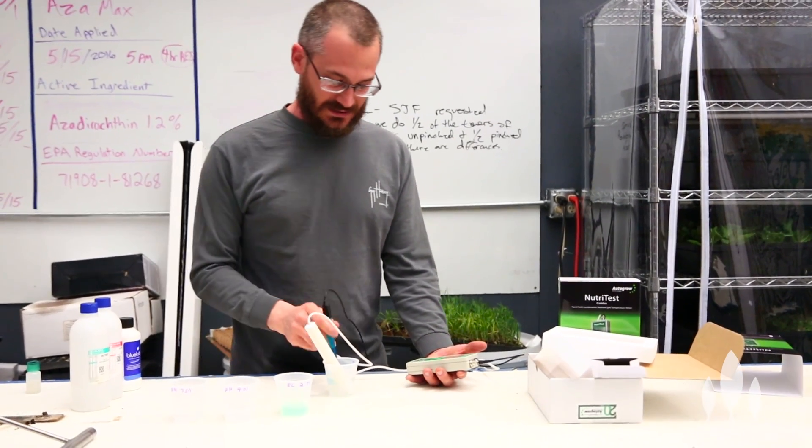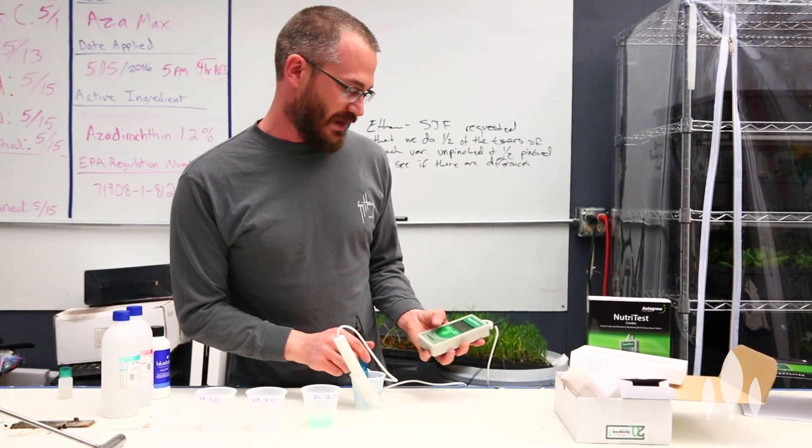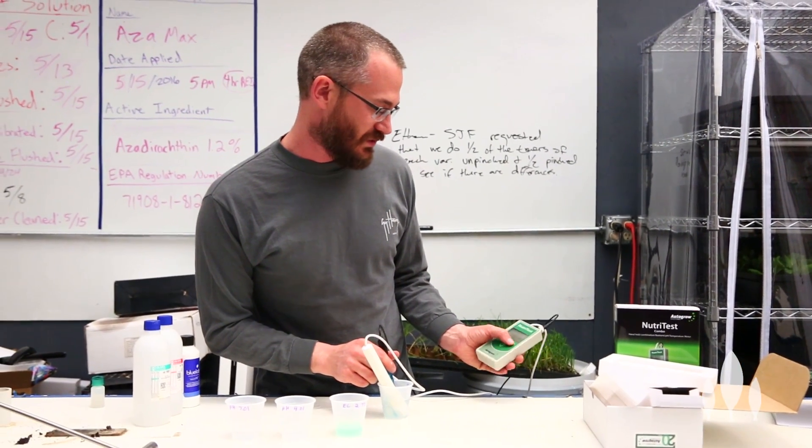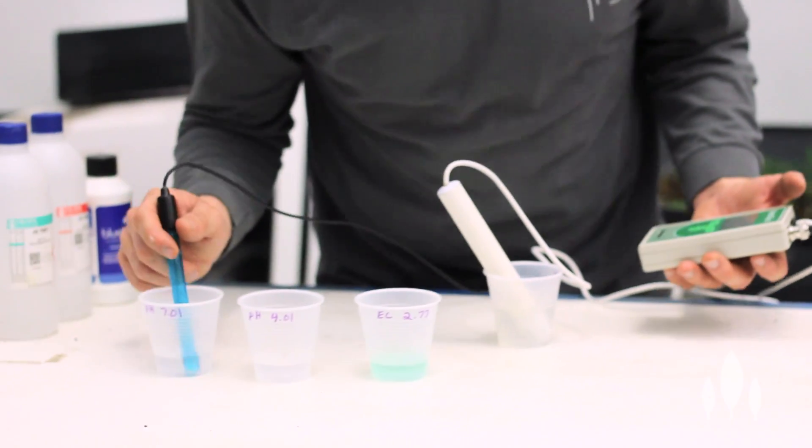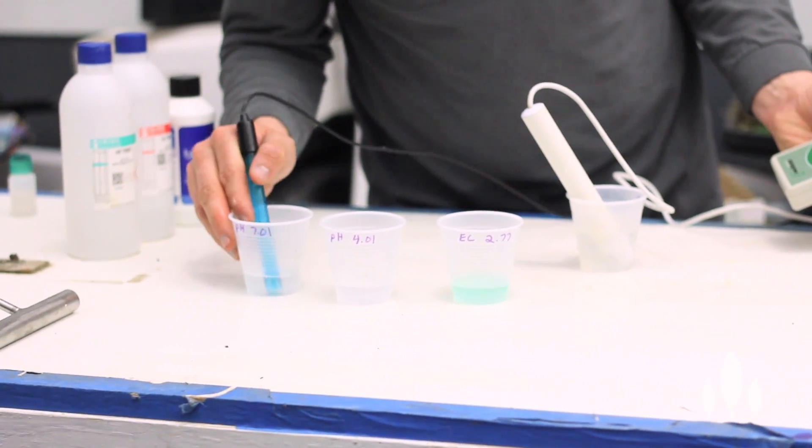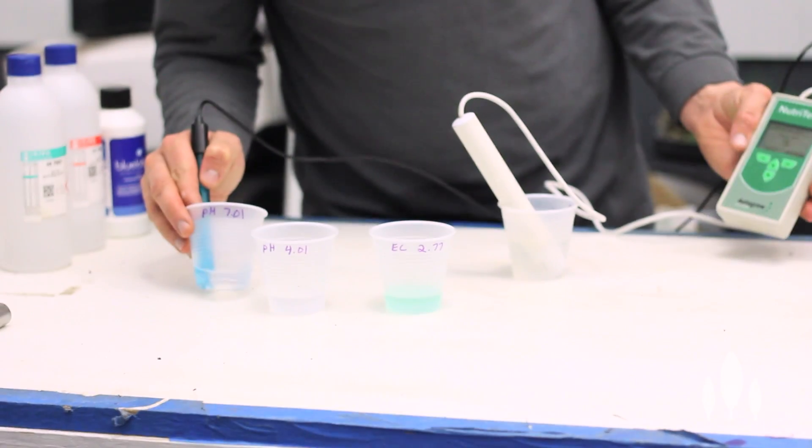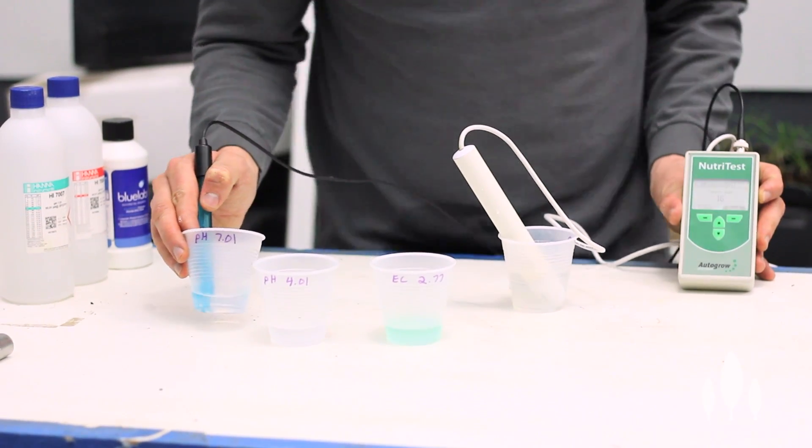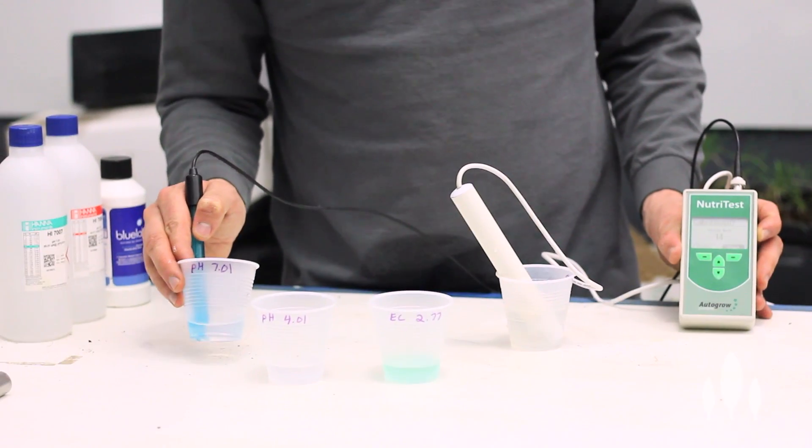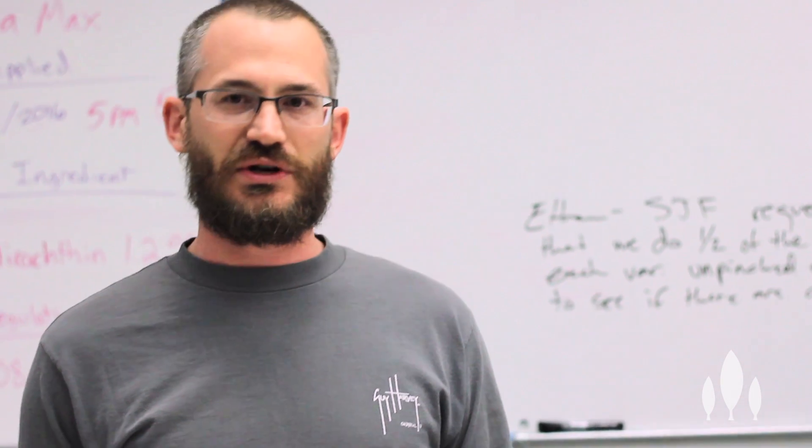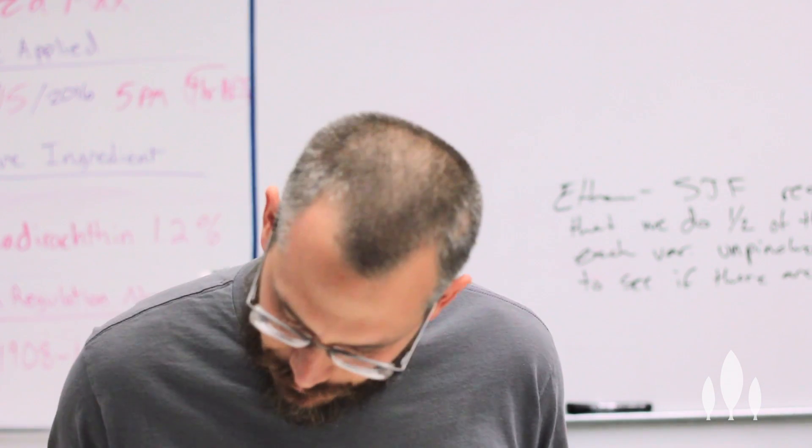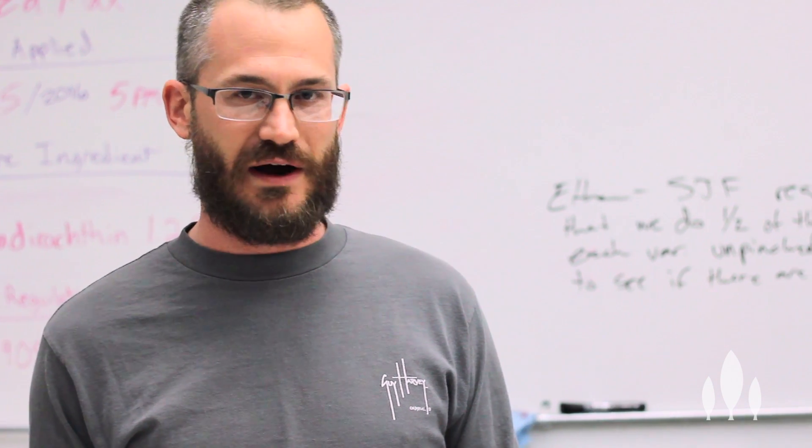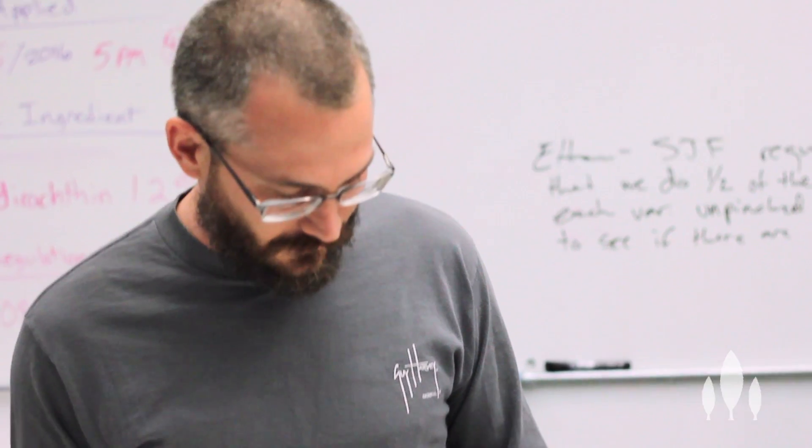EC is calibrated at this point, and I don't want to let that pH meter dry out. Now it's time to calibrate pH. So we're going to go down to pH, we're going to hit select, and pH 7 buffer. So I've got pH 7 buffer right here, start calibration, start. So we're just going to wait while that calibrates, counts down 17, 16. And the reasoning for this is that it needs to be in there, it's measuring like once every millisecond or something, right? So it builds this huge kind of data set, and then it averages all of those readings, because it knows it's going to end up with a pH of 7.01 once it all averages out.